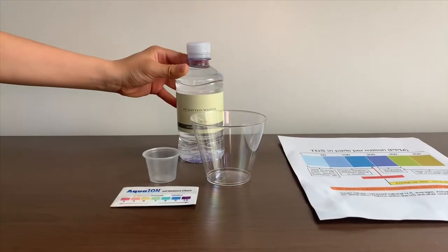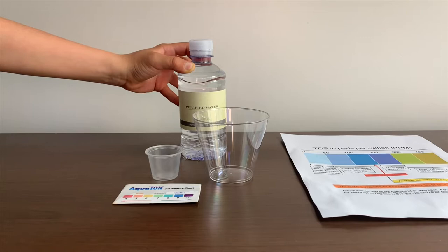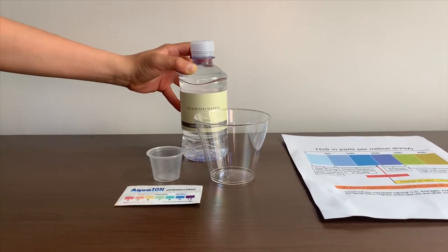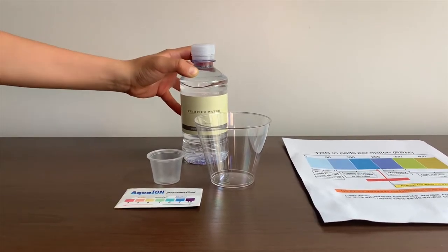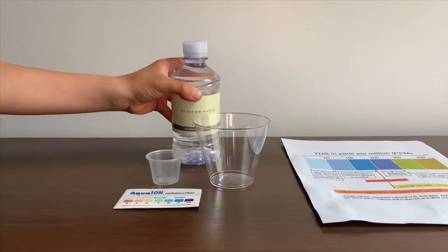This is purified water from the Venetian and Palazzo hotels in Las Vegas. It is sourced from municipal sources in California. Let's test the pH and TDS levels.